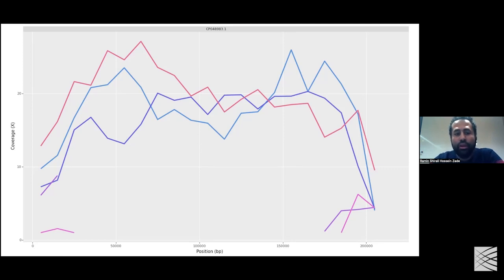Personally, that's actually the main motivation that we developed HAT. I find interpreting the results of nPhase a little bit hard, because for some reason it has more clusters than the number of haplotypes. For example, here or here.